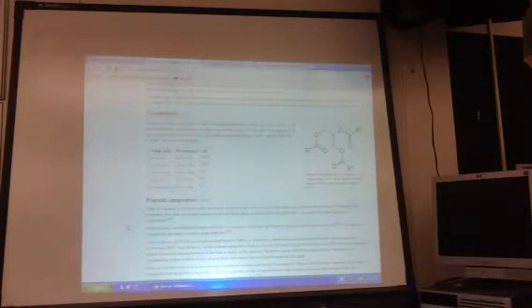The formula that I gave you is a gross oversimplification. It represents one component, the primary component, of olive oils. So, does it completely represent correct formulas for products? No, that's why it doesn't balance. You can't really balance it. If we got the actual formula for an actual sample of olive oil, it would be a much more complicated equation, but it would balance. So, we're not going to do that. But this gives you an idea, and you got pretty close.